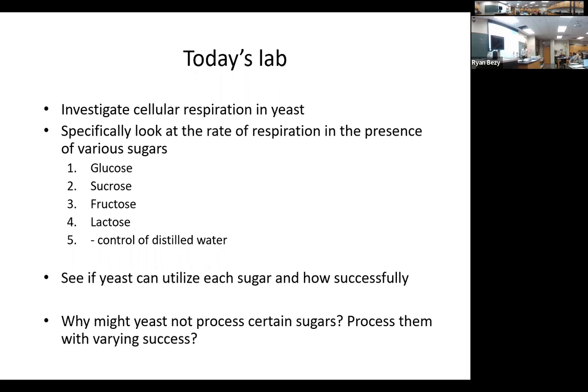All right, what we're going to do is see, can the yeast eat glucose and how well? Can they eat sucrose and how well? Can they eat fructose and how well? Can they eat lactose and how well? The better they recognize and process a particular sugar, the higher their respiration rates will be. But there's probably going to be at least one of these sugars they cannot recognize, and its rate of respiration is probably going to be similar to the water sample. Questions about that? All right, we're going to get this started.